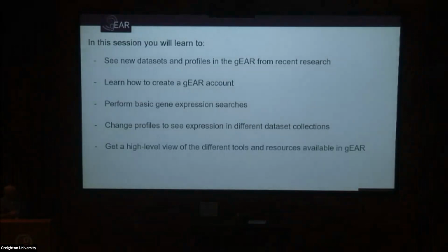I'll go through these as slides. I'll show you at the end that there are videos, like walkthroughs, of how to do all of this. If we don't have time to go through them in here, I'll show you how to get to them on our website.